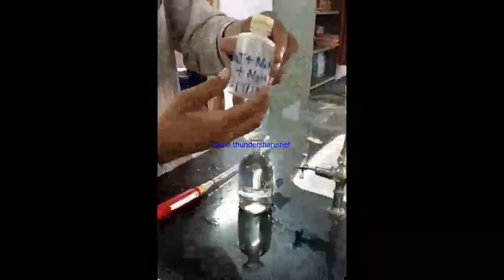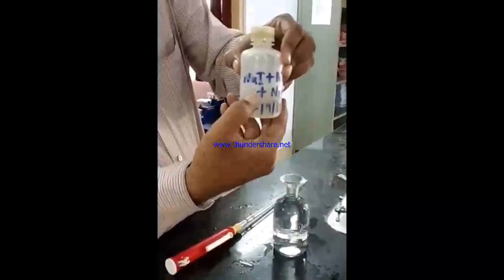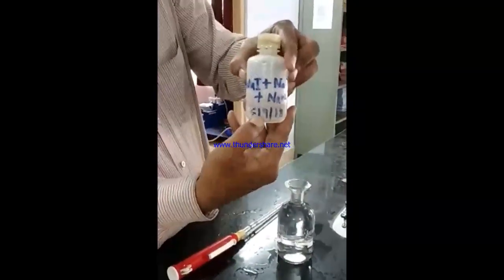This is 1 milliliter. In the marking, if you see 7 to 8, it means we will release 7 to 8. That will be 1 milliliter. This is alkali iodide azide. 1 milliliter we will take.